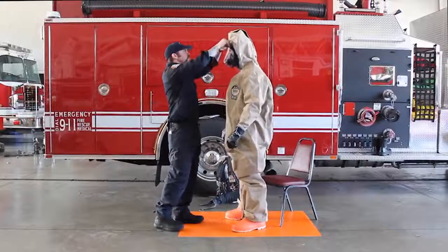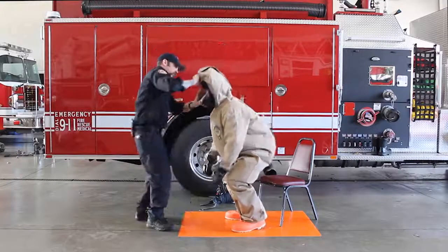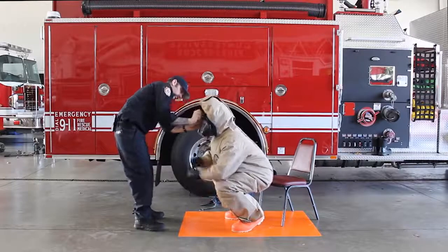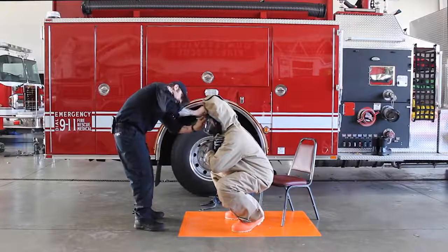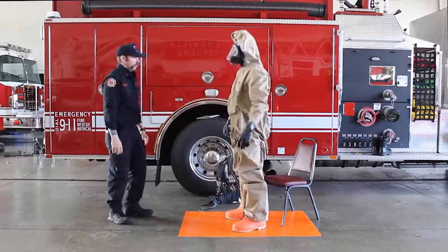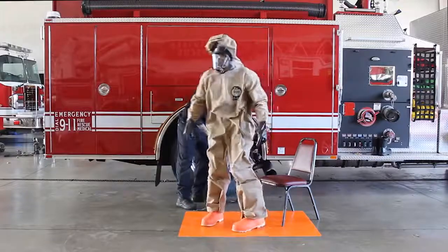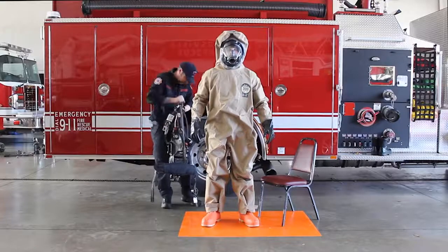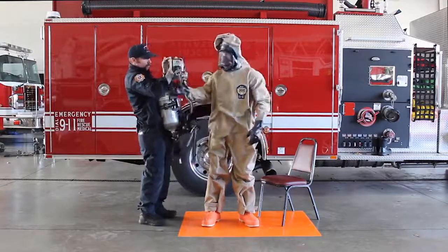With the assistant's help, the user should squat down and expel air from inside the garment through the face seal interface. Don the appropriate SCVA and adjust straps for fit.